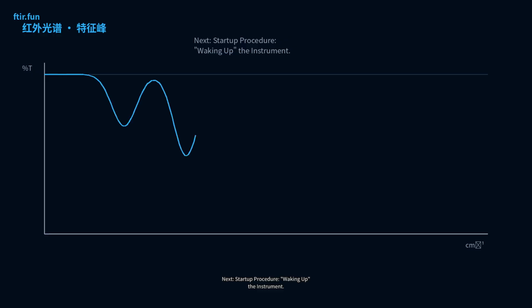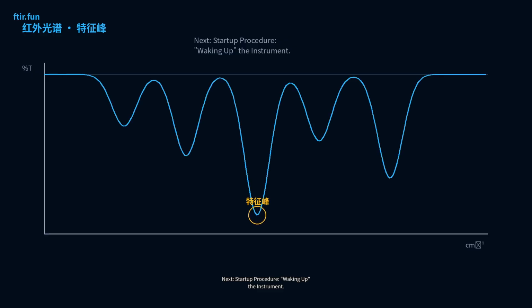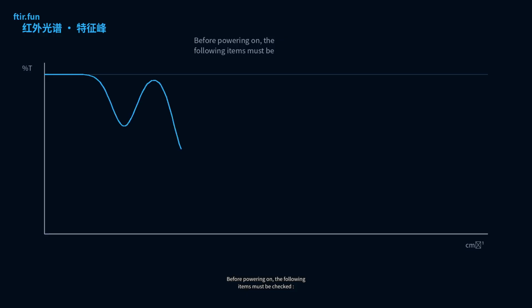Next, startup procedure. Waking up the instrument. Startup is not just pressing the power button. Before powering on, the following items must be checked.